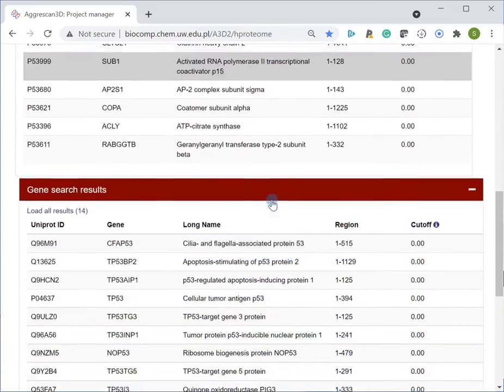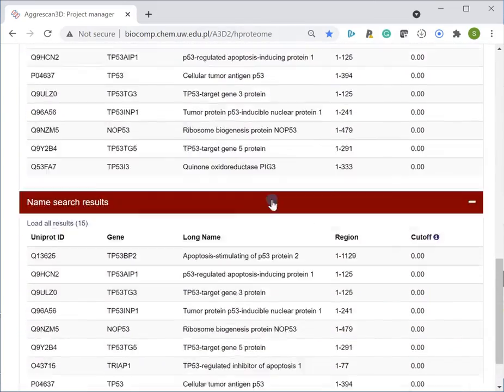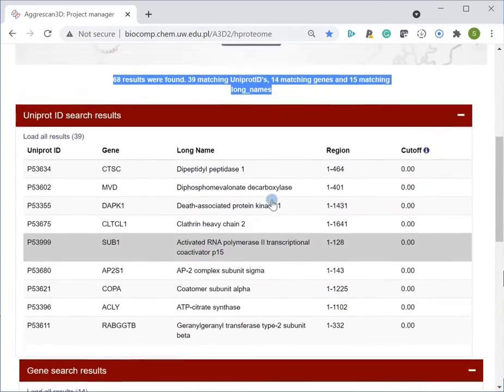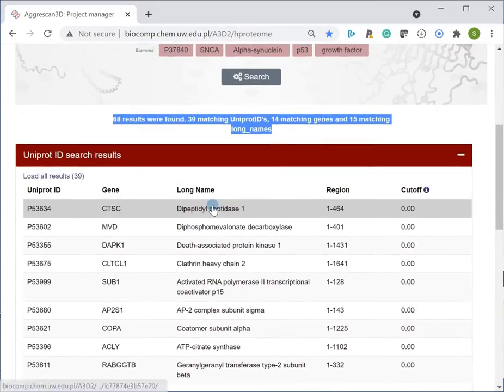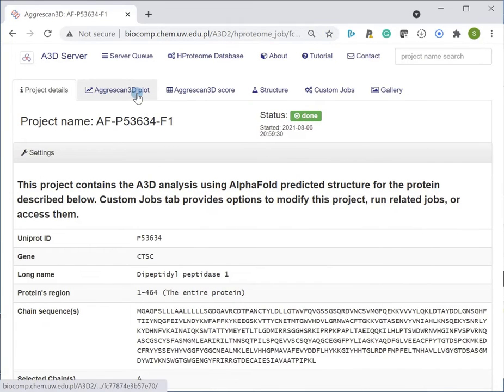By selecting the desired protein in the results list, each protein entry can be accessed, leading to the A3D result pages. The A3D predictions are presented in a series of tabs that link to pages containing prediction results described in different forms.